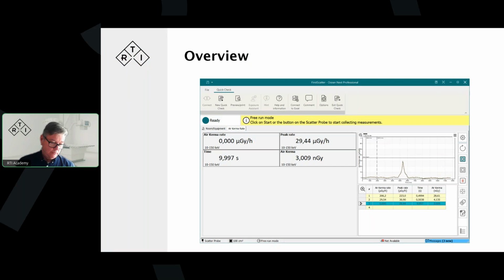There is another one with a 10 square centimeter, and that is for barrier testing in some certain areas that you need to look at. But those are described in the standard. So you need to decide, do you want to follow the standard or not? If you do, then 100 square centimeters is what is called for.